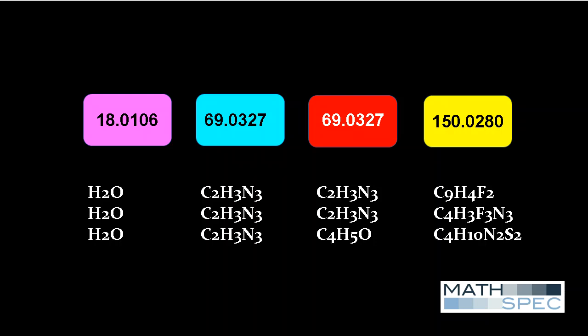In some applications, such as environmental chemistry, the spectrum might be that of a known compound. Many of these known compounds are found in the massive Pubchem Compound database. We can search the massive database for any compounds that have essentially the same molecular weight and that also have a molecular structure that can be partitioned into substructures with corresponding masses.